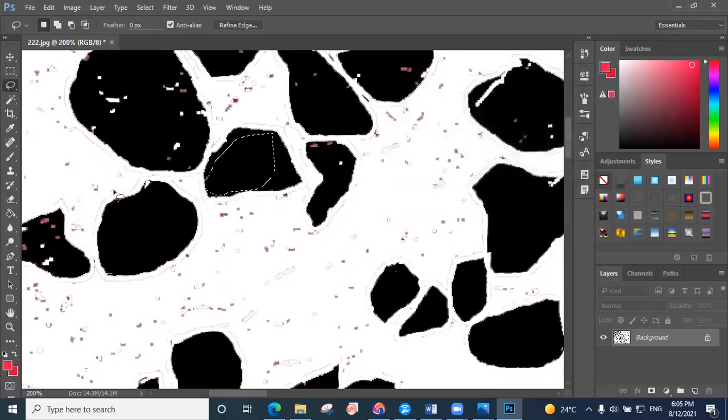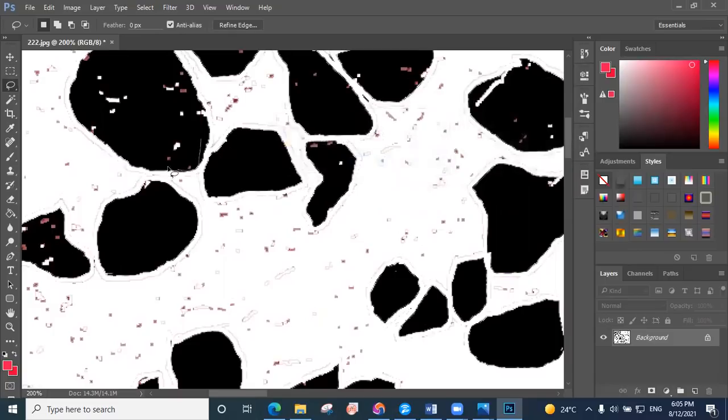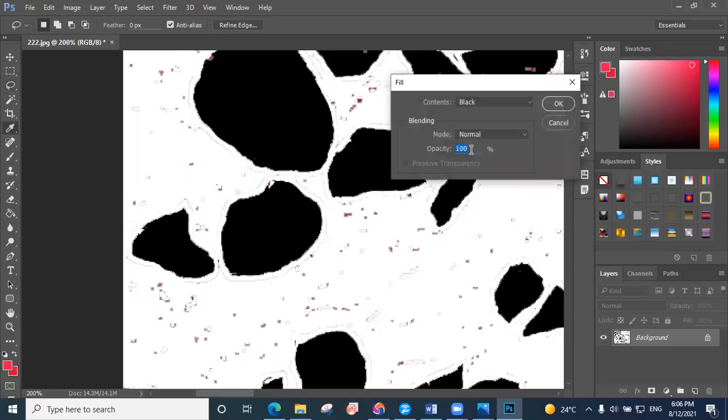Especially for comparing, if you have some structures you need to compare, you need to follow these steps. Even if it's a little longer, it could solve the problem you have.